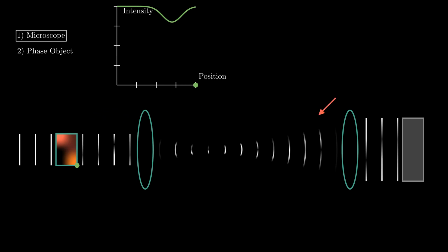Therefore, we use optics elements to take the field and magnify it as it is. The magnified field hits the camera, which measures its intensity. Since the optics copy the field exactly as it is, the intensity pattern on the camera equals exactly the pattern right after the sample.